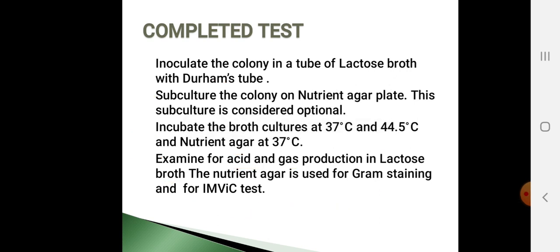That's all for the MPN. The most probable number method is used to check whether the water sample is contaminated with fecal type organisms, or we can say the presence of coliforms in the water sample.